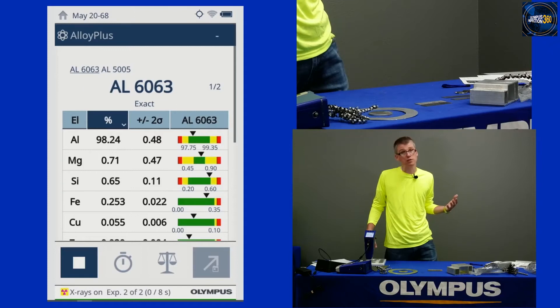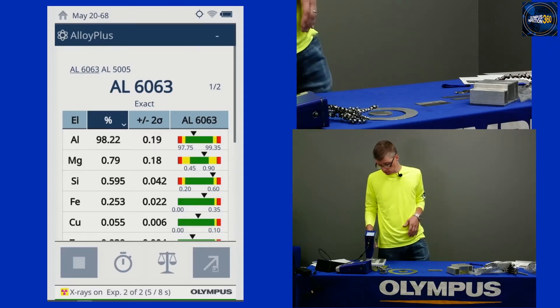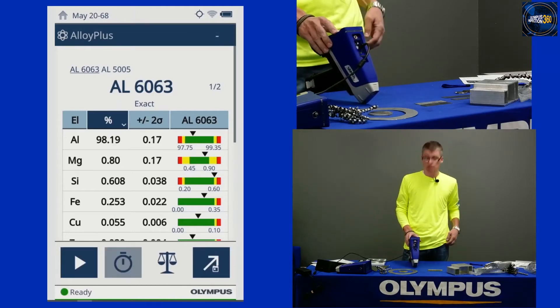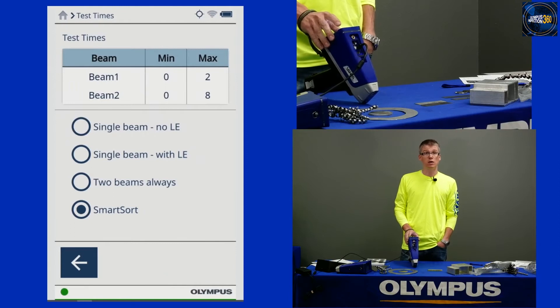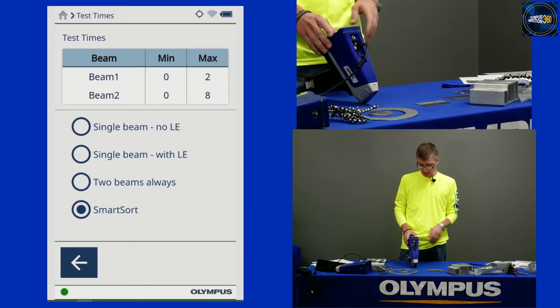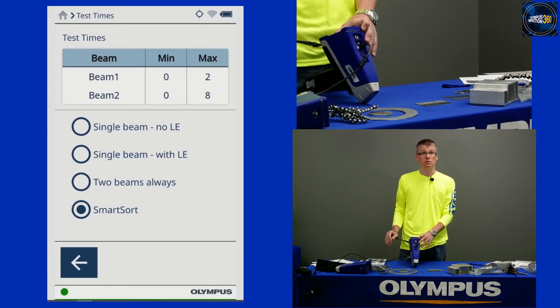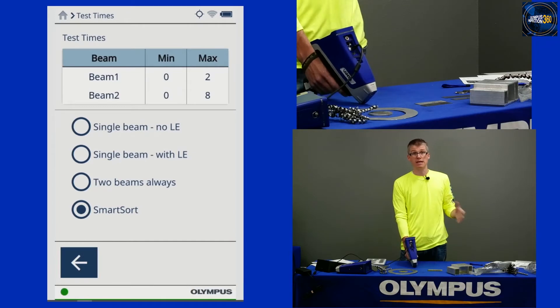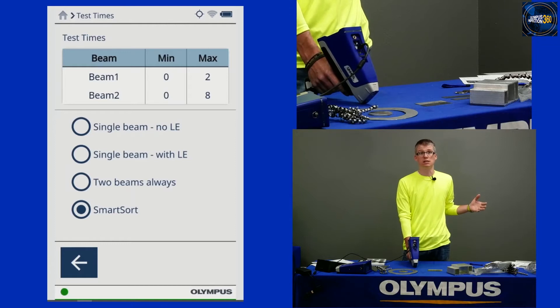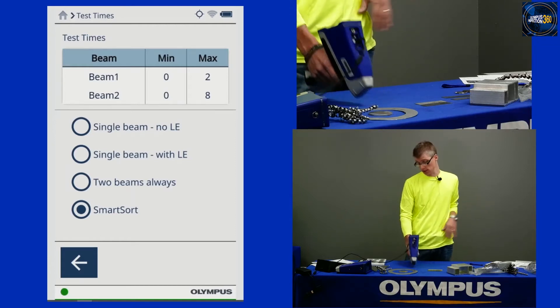Exact match right away — it rolls into that second beam to confirm if needed. So in terms of beam settings: if you know you're going to be working with high temp and super alloys, go single beam no LE. If you're going to be working with aluminum, you need that LE setting — you might want to go with smart sort to make the decision on your behalf. This maximizes your efficiency: take short tests when you can get away with them, and longer tests when they're needed based on the alloys, so you don't have any costly mixups.